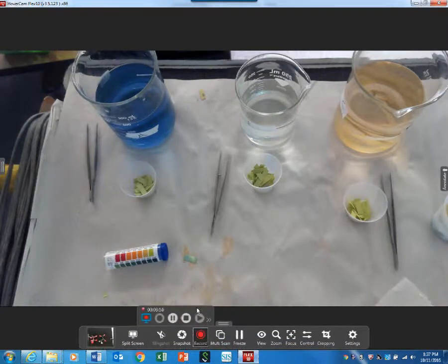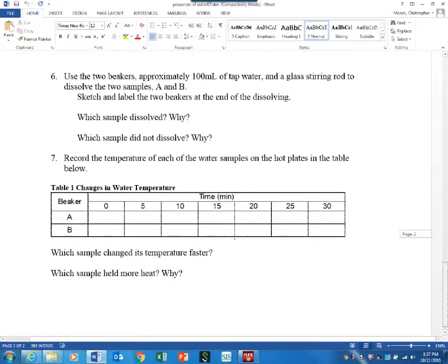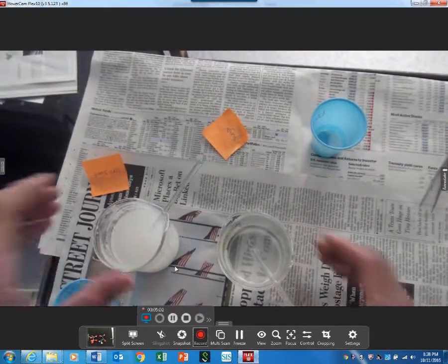Okay? Now, let's talk about the second and third. Second time you're going to be away from your seat. All right? So we have 2 beakers, and we also have step 7. So step 7, one group is going to do that for you. Now, the other one, as you come over, you're going to walk to the back.